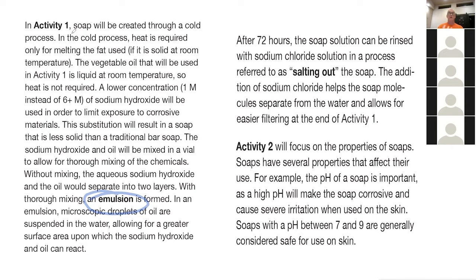Because what we want is for the reaction to take place, and the reaction is only going to take place if the oil is in the presence of the sodium hydroxide. If it separates, then you've only got a layer of oil on top exposed to the sodium hydroxide. The reaction will only take place in that small layer, so we won't make very much soap. So we want to get as good an emulsion as we possibly can, with as small droplets as we possibly can, so we get access to the sodium hydroxide. And then we're just going to leave it for about three days. And then you guys are sort of on your own.